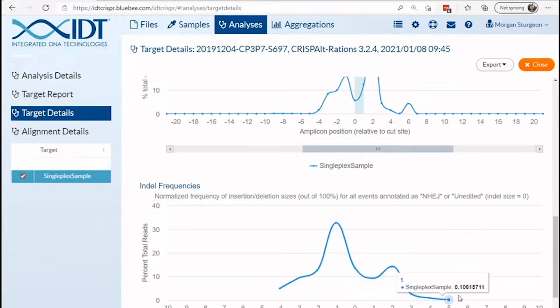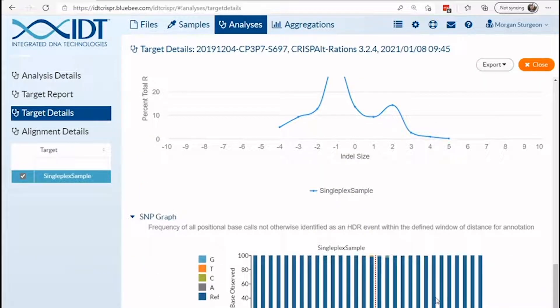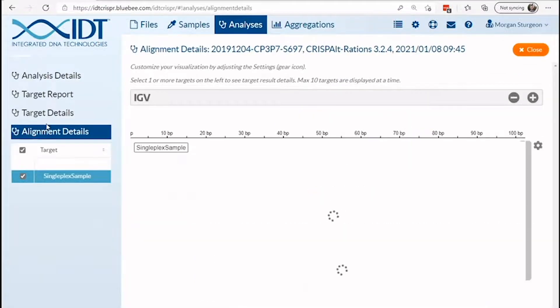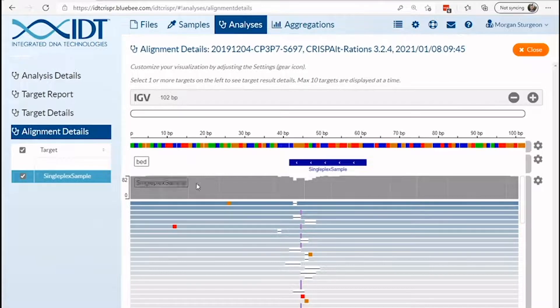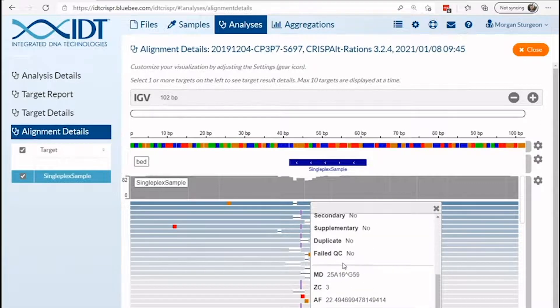We also include a SNP graphic that shows the frequency of non-reference-based changes. By navigating to the alignment details page, you can view the distribution of alleles in the sequence population using IGV. The frequency of the event and read count can easily be obtained by clicking on the event of interest and looking at the AF and FQ tags.